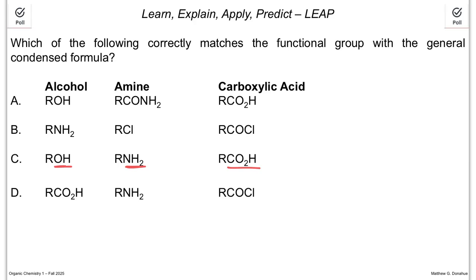Amine, NH2, NH, or N, based on its class. Acid, CO2H. Where we're going with this, you're looking at the word, the minimum elements in the bonding pattern of the functional group, and then you're going to associate that with a pattern in the IR.